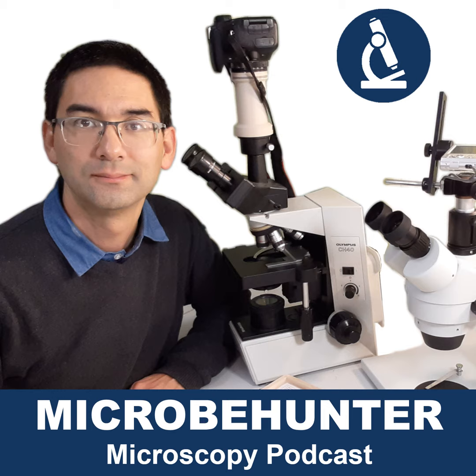When a halogen lamp, so I'm not talking about LEDs. LEDs are pretty insensitive in this respect, but halogen bulbs are quite sensitive, and when you have a cold halogen bulb and when you turn on the light, then the resistance is quite low, and therefore there's a high current flowing through the halogen bulb, and this might actually break it. This is, by the way, the reason why most of the traditional lamps that we've used break when you switch them on. The reason is that they're still cold.